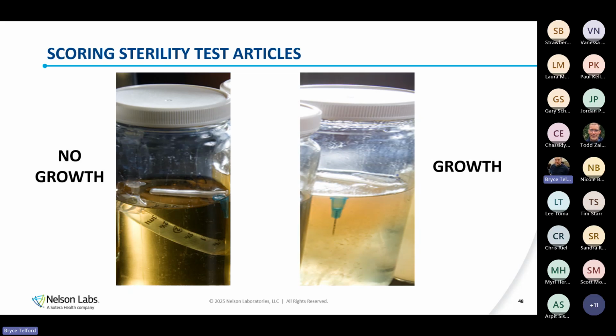So the new requirement is if I'm extracting for a test of sterility, so for example, if I'm only flushing this tube, then I have to do a recovery efficiency, just like I would for bioburden. And then it says to perform a documented risk assessment and outcome of that risk assessment. It doesn't really give any other guidance.